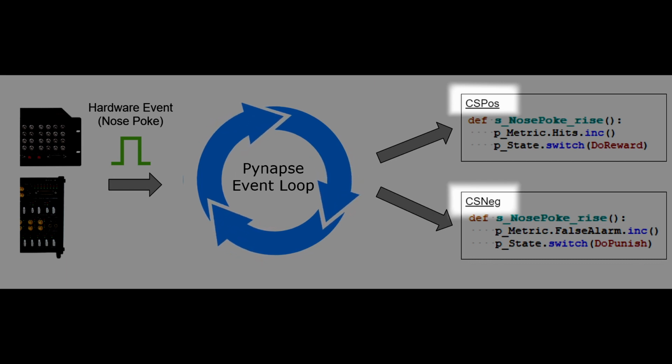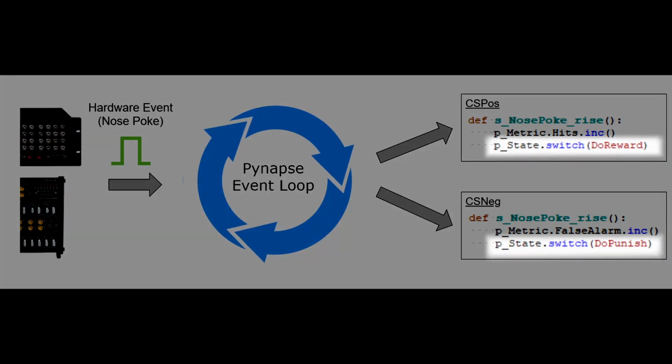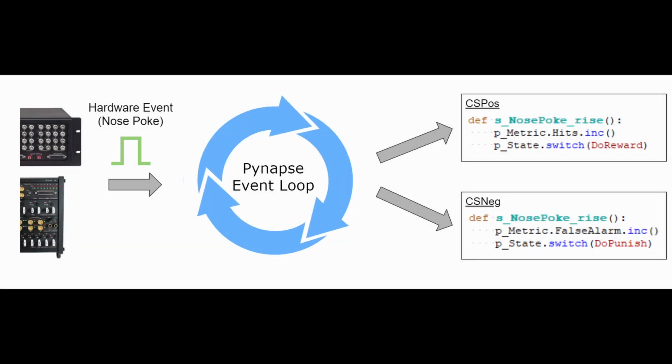So you code the different slot methods that react to the nose poke and add them to different states defined in your Python code. You also code the conditions needed to advance through the states in your experiment. Using states helps you organize your code and more efficiently record the subject's progress through the trial. We'll see this when we start coding it up.